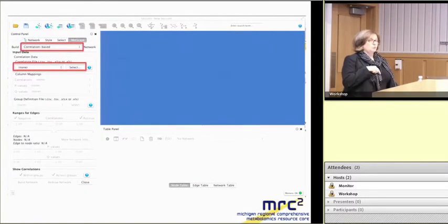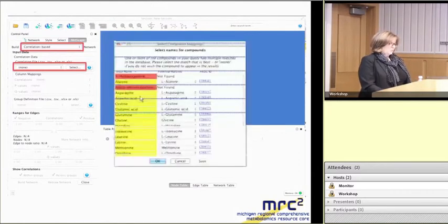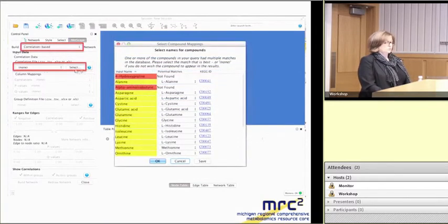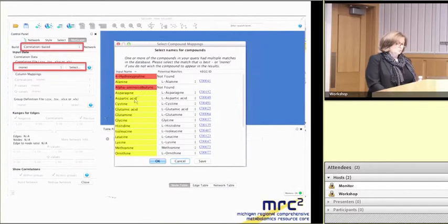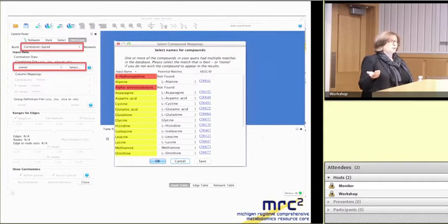Now, you don't have to use it. If you have your favorite algorithm for doing that, you're welcome to use that. And the format, again, is very simple. And that will be available when we're ready to release that. But anyway, the screen that you would see once you have selected and loaded your file, in this case, the metabolites or features are identified by name. But since we're no longer limiting it to metabolic pathways, your compound is not going to be discarded just because it's not found in our database, which means that potentially you can load your unknown features as well, which is a serious expansion of what we did before.